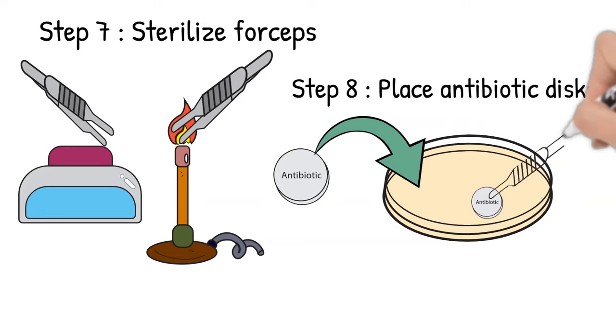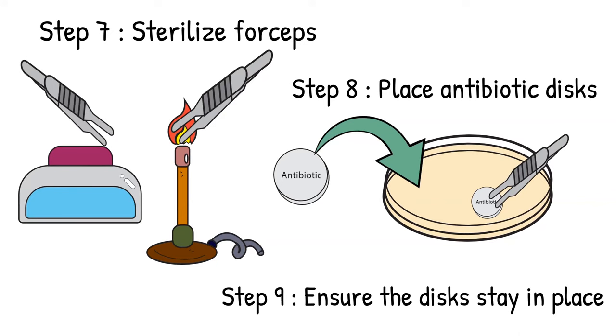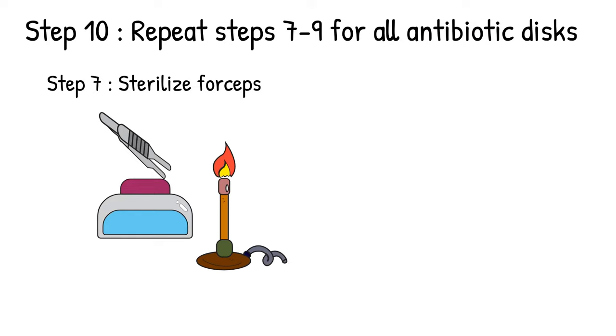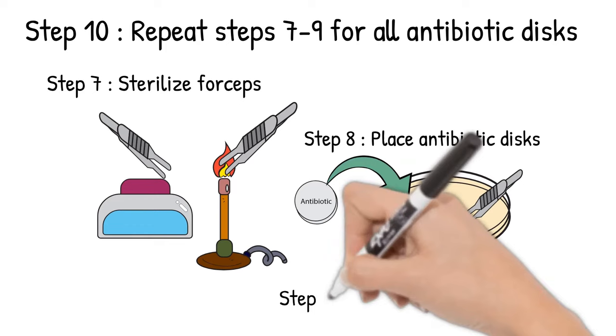Step 9: Use the forceps to press on the antibiotic disc lightly to make sure that the disc will not fall off the plate during the incubation. Step 10: Repeat steps 7 to 9 until you place all the antibiotic disc types.